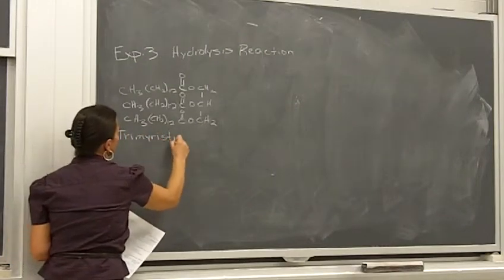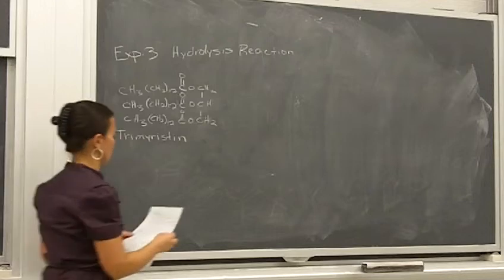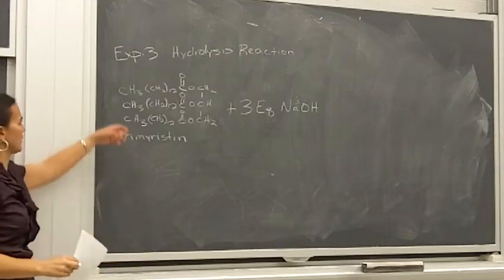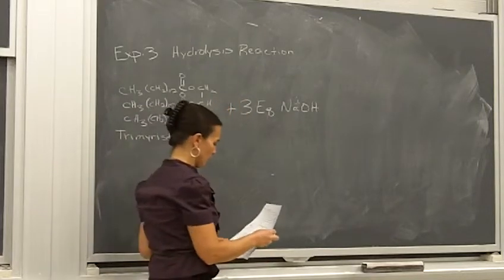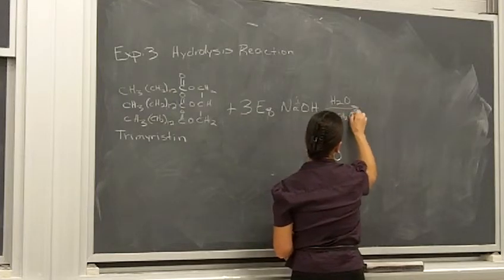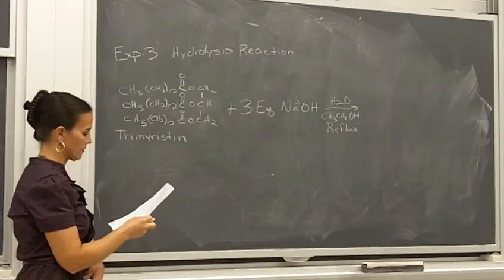And what we are going to do is use sodium hydroxide, okay? With esters, you can hydrolyze them with acids or bases. We're going to use a base, okay? But we need 3 equivalents of the sodium hydroxide because we've got these 3 ester chains, okay? So it takes 1 sodium hydroxide for each ester chain to perform the hydrolysis. And our sodium hydroxide is in water. And then we're also going to use ethanol as our co-solvent, and we're going to perform this reaction at what is called reflux. So I'll talk to you in a little bit about what is meant by reflux.